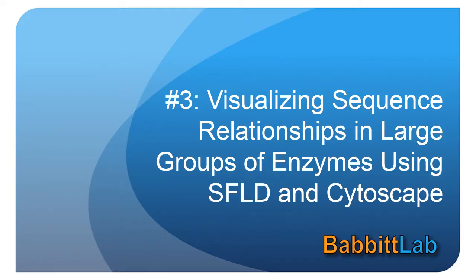This tutorial will introduce you to the Cytoscape software and how it can be used to visualize sequence relationships in a large group of related enzymes. We'll be using Cytoscape version 3.2.0 along with sequence similarity networks downloaded from the Structure Function Linkage Database, or SFLD.